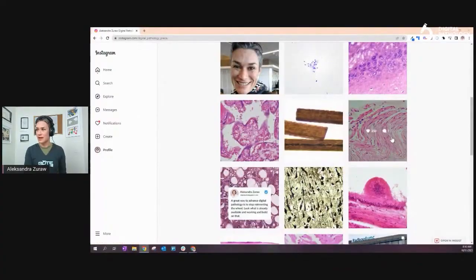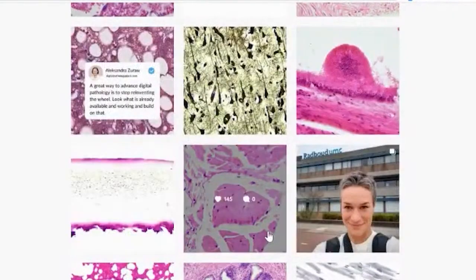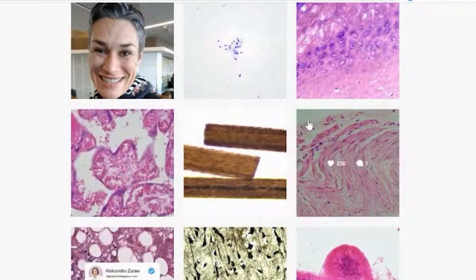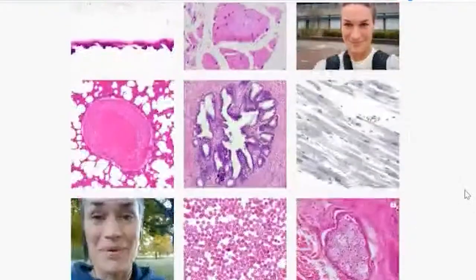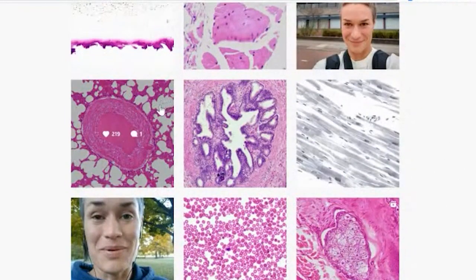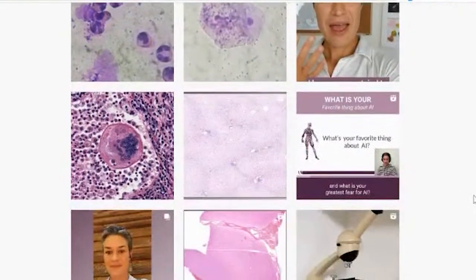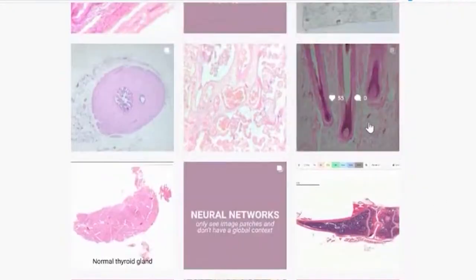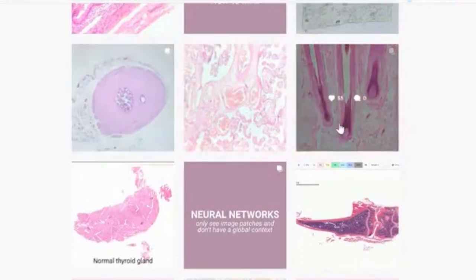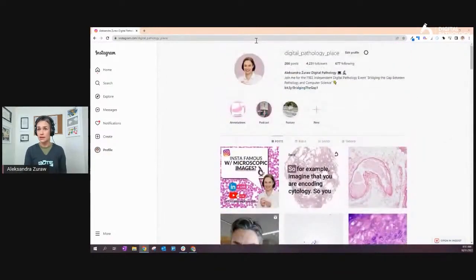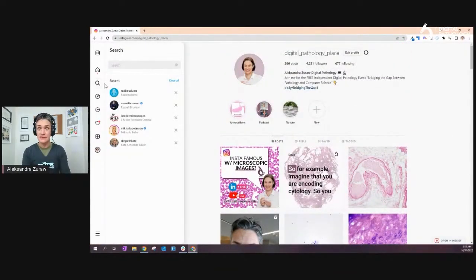Let me show you the difference on my Instagram feed — here I didn't do the white balance, here I did, here I did. You can see this background is grayish, this one is somewhat yellowish. But for everything that's just H&E, white should be white. Where I did the white balance, white is white; where I didn't, it's not quite white. The purpose of white balance is simply that white is white.